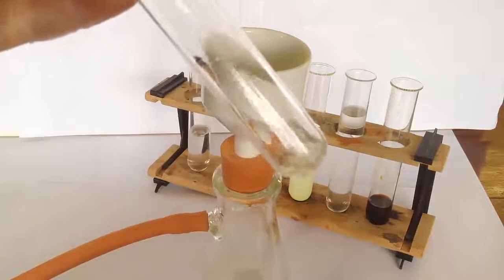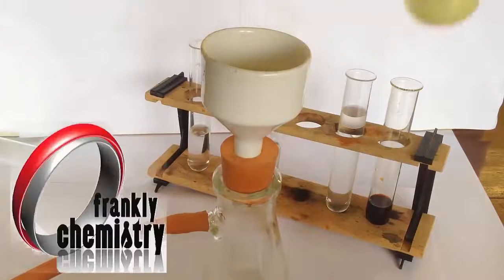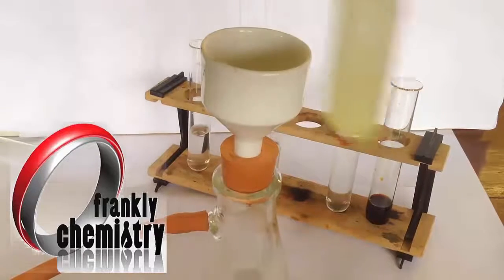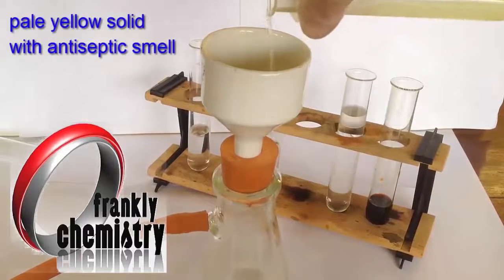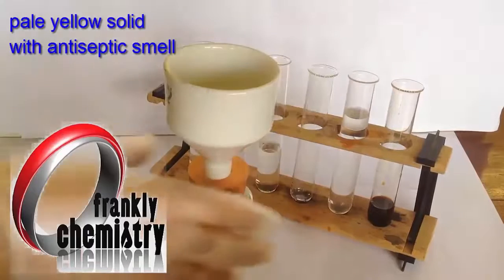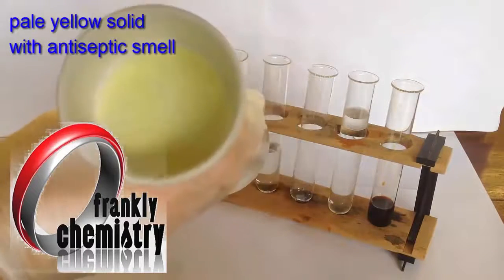You can see I haven't made a great job but there's still some solid left behind, some of the triiodomethane left behind there. Pour this other one in as well. You can see actually the solid there has precipitated to the bottom. That's the triiodomethane, a pale yellow solid with an antiseptic smell. Pour this in as well, just to be able to show you what the solid looks like. And there it is there on the filter paper.